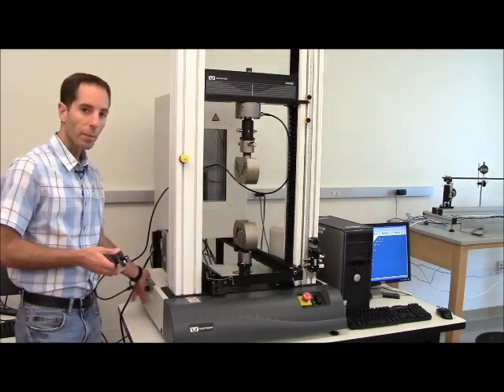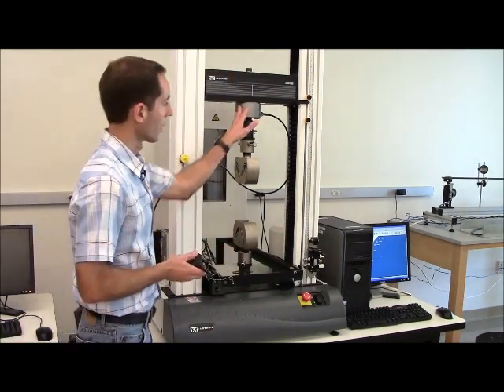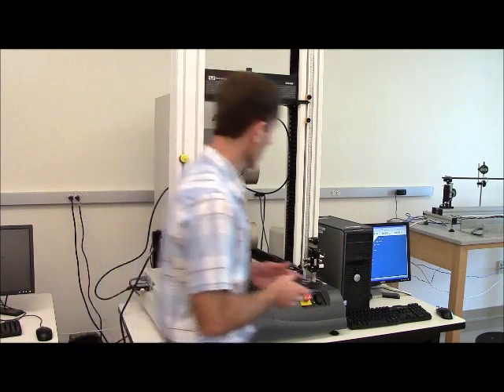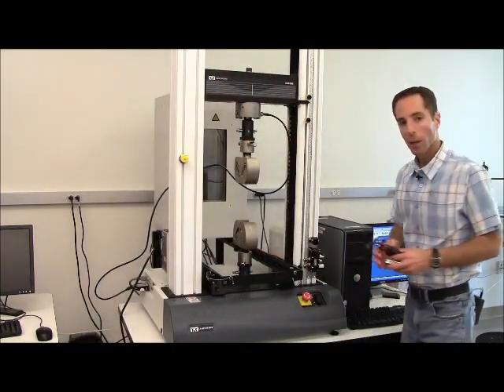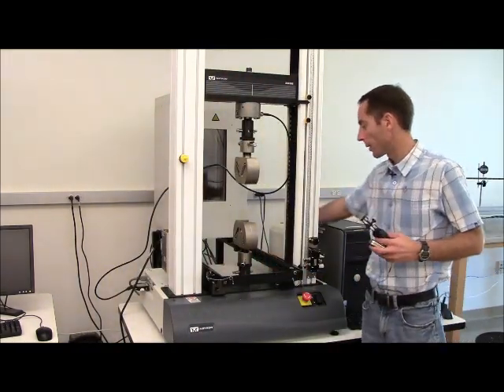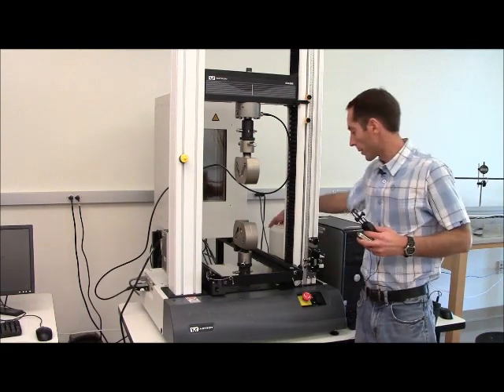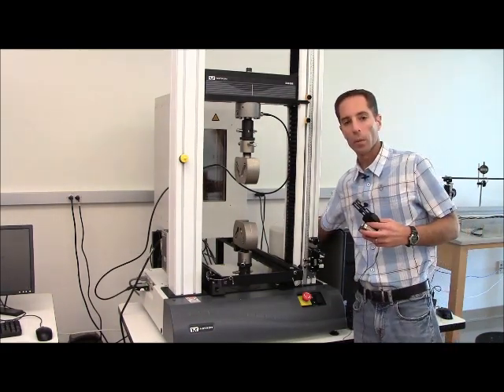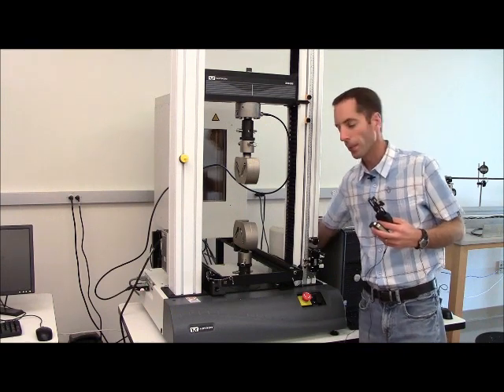Over on the side of the machine, we have our connections for our load cells, and if an extensometer is being used, that is done in this area over here. The power switch to the system is somewhat hidden. It's back behind this piece right here, next to the power cord that comes in. Look in that area and you'll find it.